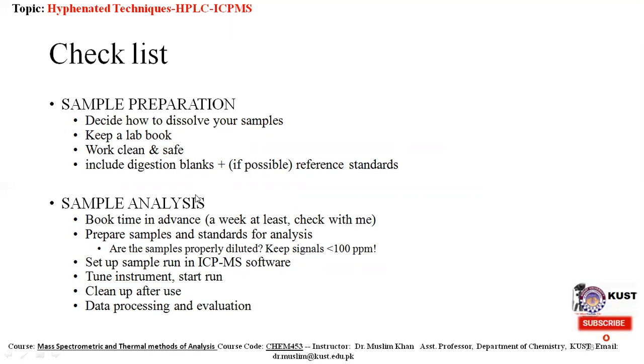Check with me, meaning the supervisor, whether the instrument is available or not. Prepare samples and standards for analysis, usually on the same day, just an hour before. Set up a sample run in the ICPMS software. Tune the instrument, start the run, clean up after use, data processing and evaluation, and then you have done your experiment.